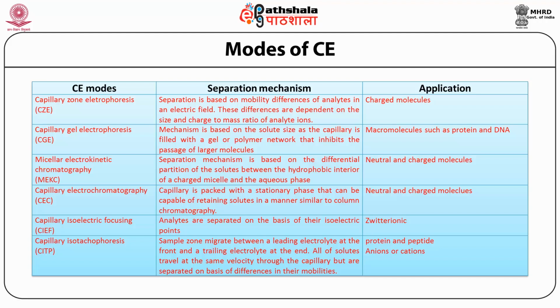Zwitterionic applications, and finally capillary isotachophoresis (CITP). The separation mechanism for this is that the sample zone migrates between a leading electrolyte at the front and a trailing electrolyte at the end. All of the solutes travel at the same velocity through the capillary but are separated on the basis of differences in their mobility. Proteins and peptides, anions or cations, are separated using this technique. So this is all about the modes of CE.